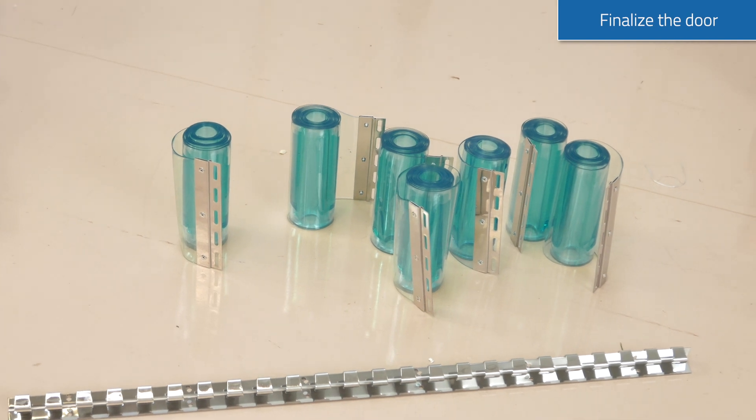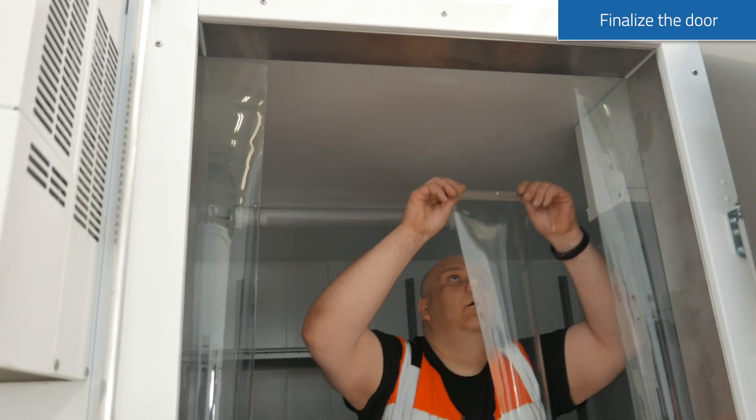The transparent plastic strip curtain is installed inside the doorway.